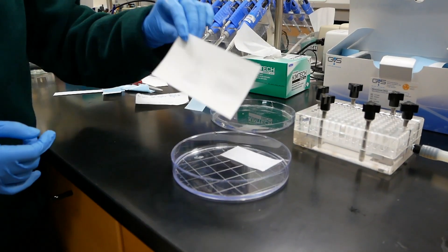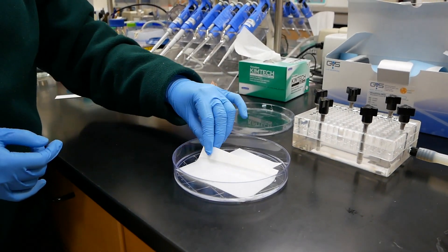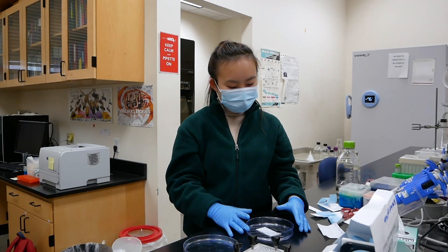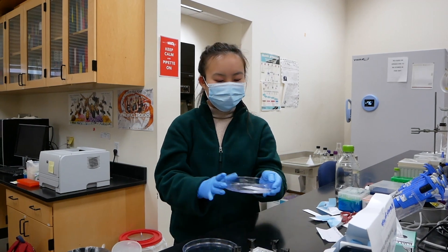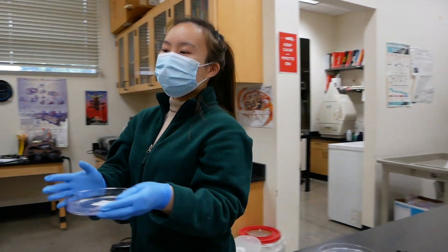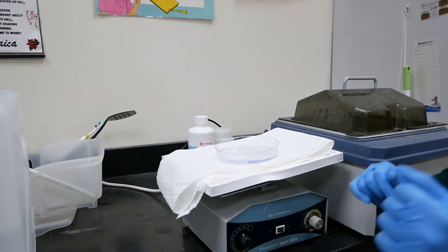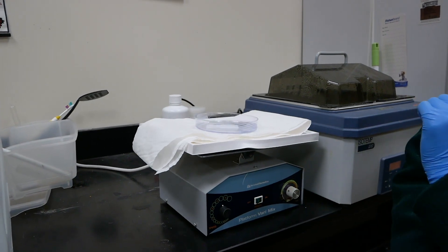We're going to do the same thing with the Whatman paper — soak it in water starting from the corner, submerging it gradually downwards. After the nitrocellulose membrane has been submerged, we're going to move it over to the tippy topper, where we are going to let it soak for five minutes. We'll come back to it later.